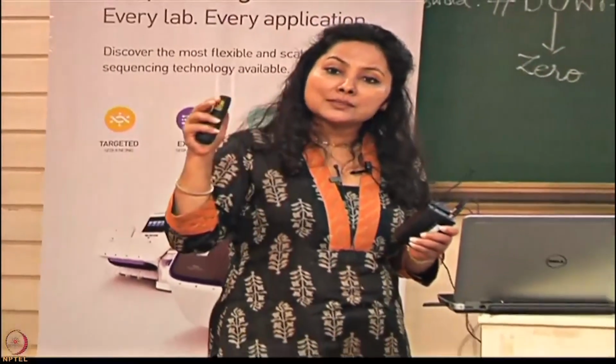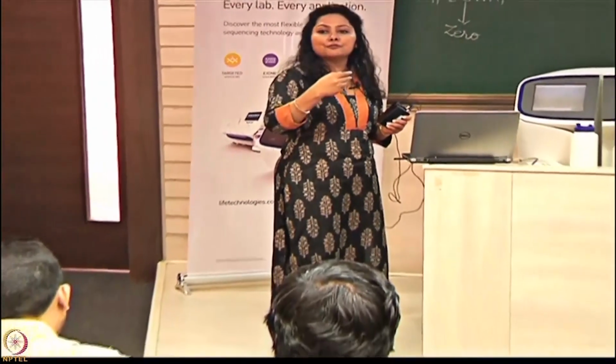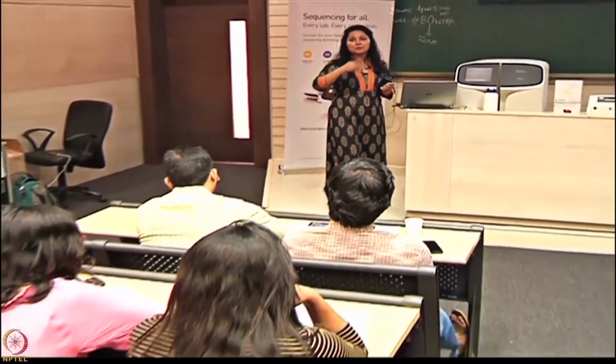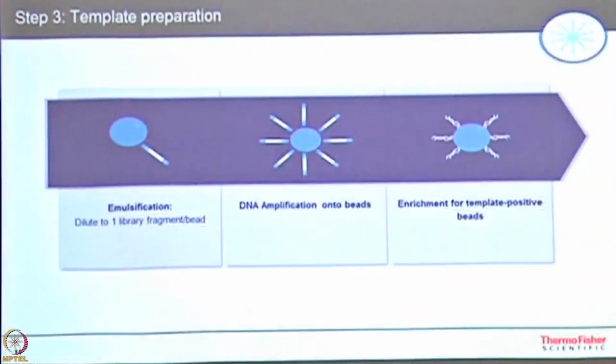Yes, we used barcoded adapters. So the system first sequences the barcode sequences, and then it sequences your region of interest. And then it makes the bins: okay, this read belongs to this sample and it is in this bin. Once we are through with our library preparation, the next step is template preparation.